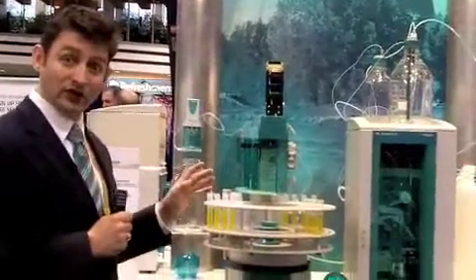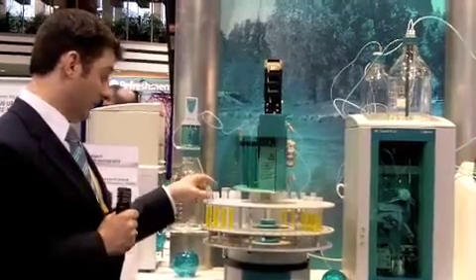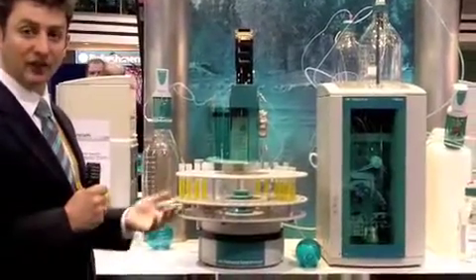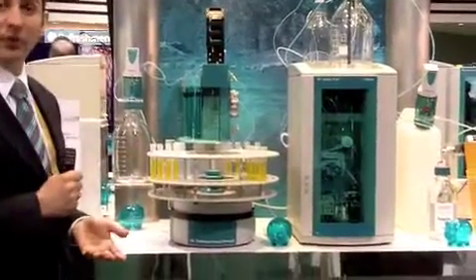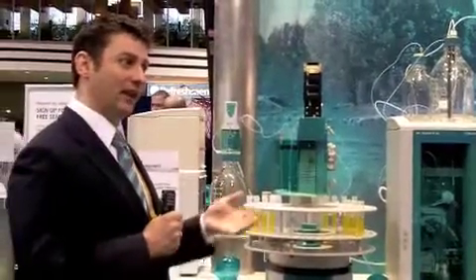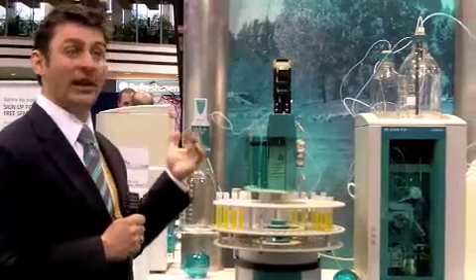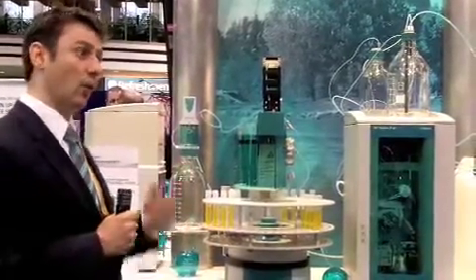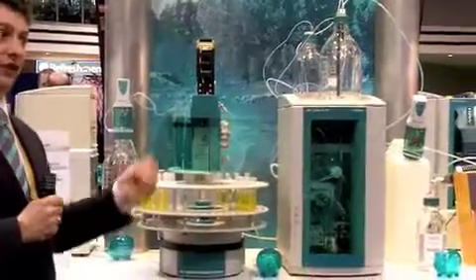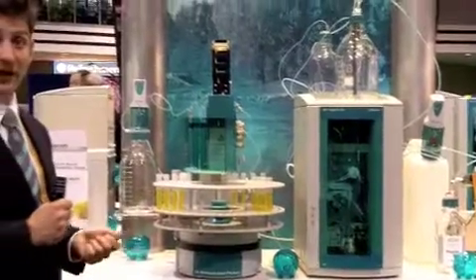The dilution system works in a very similar way. You place your sample on the autosampler, then place an empty tube on the autosampler. The system will run your sample first, and you'll get the chromatographic data out from our software. It will then evaluate the peak areas for all the ions of interest, and if one or more ions falls out of your calibration range, the system will automatically re-dilute into the empty vial to make sure all the ions of interest fall within your calibration range. It's a very nice feature.